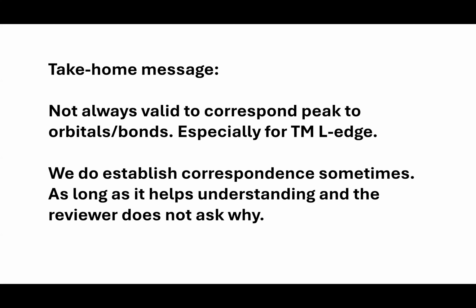I hope this message goes to your heart: XAS is embedded with the final state, which has a core hole there.